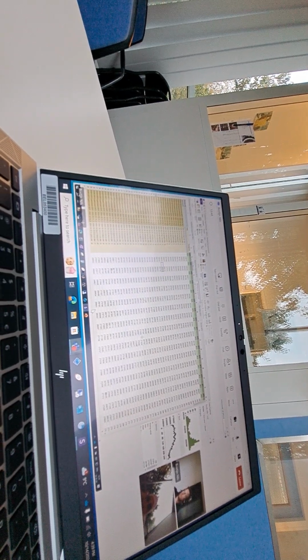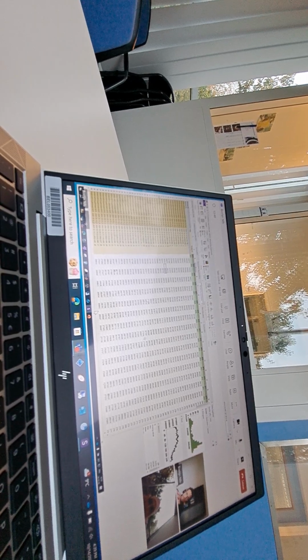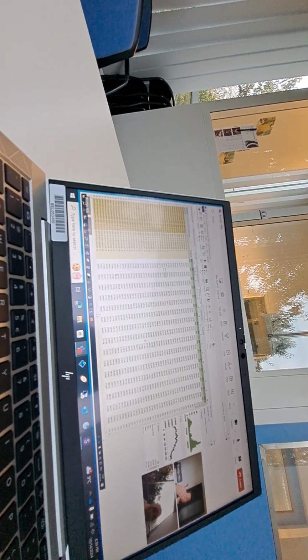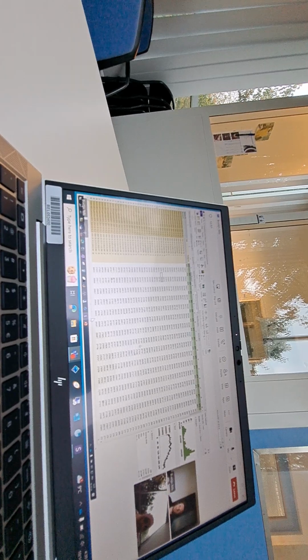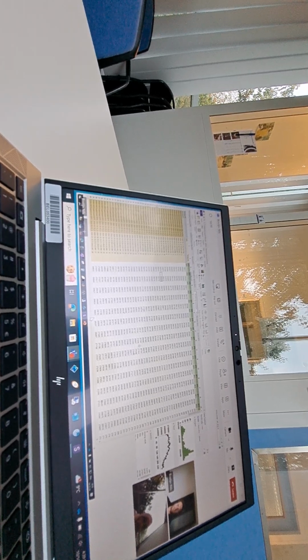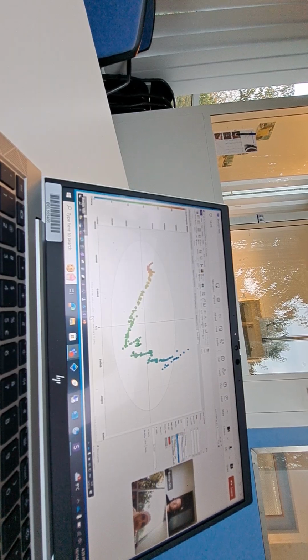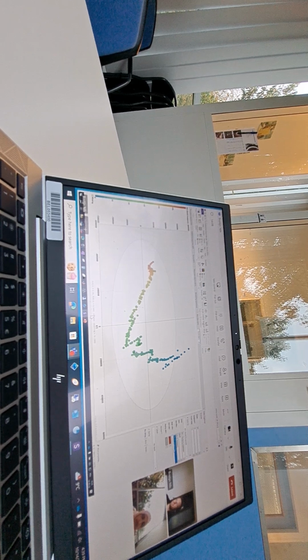You can make it even with a number. For example, you could say the XRPD: free base plus salt, and salt. And then in the scores plot, you can select the different secondary IDs you have.